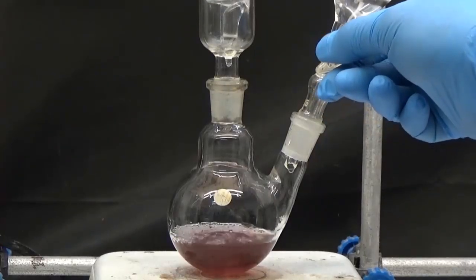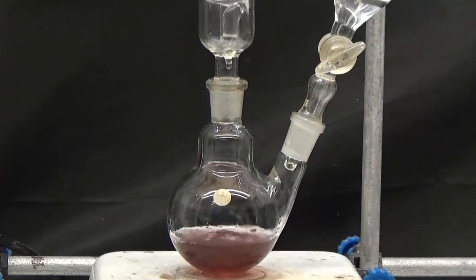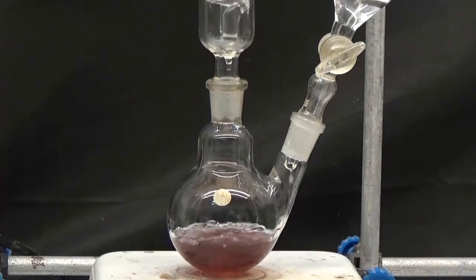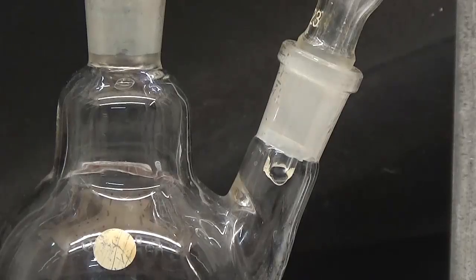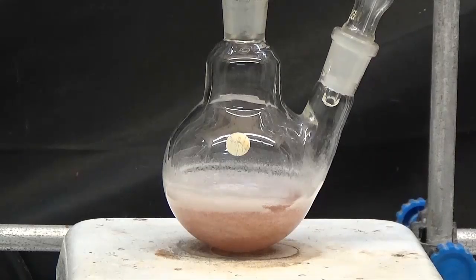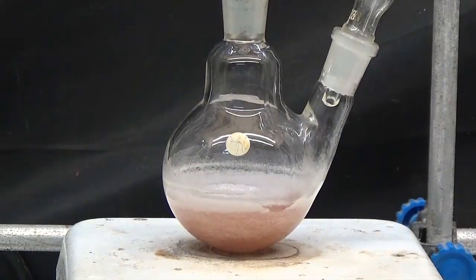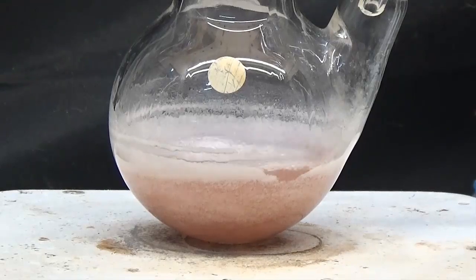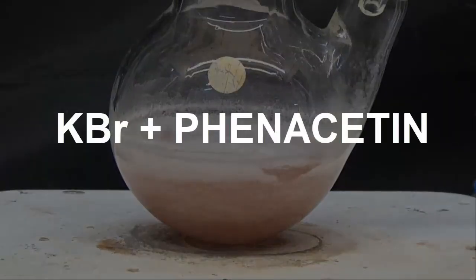After 15 minutes of reflux, without permitting it to cool down, ethyl bromide is dropped with vigorous agitation. Heat 15 minutes at reflux. Insoluble sodium bromide formation can be observed.